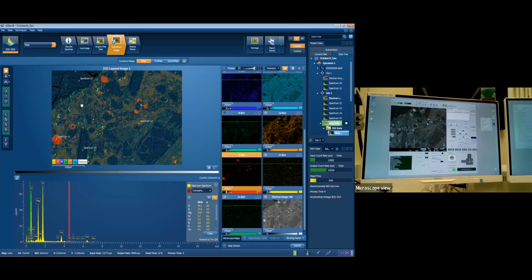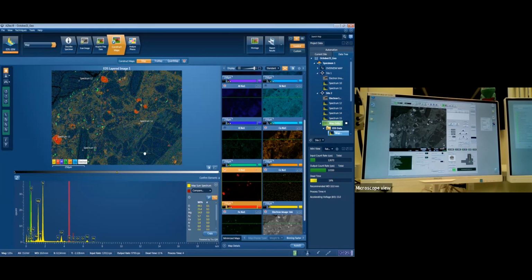In the spectacular color scheme that we have going on now, we can start pulling out these big lumps of titanium-rich stuff. And we've now been able to show that it's very different in color to these iron-rich ones. I think this one has one more sweep to go through, and then that's this map made.